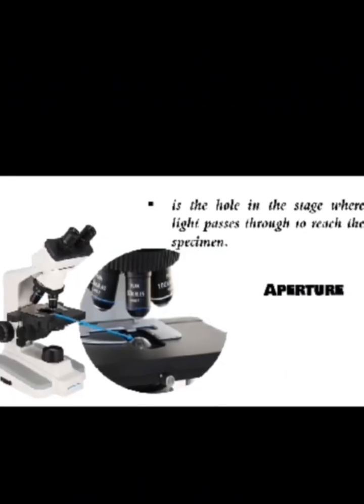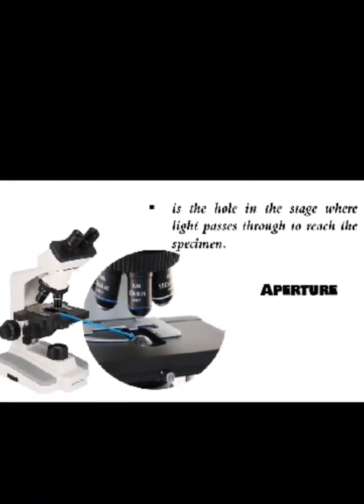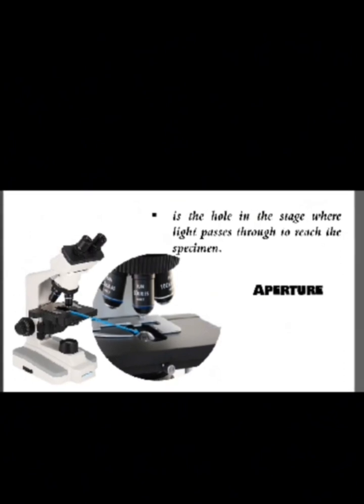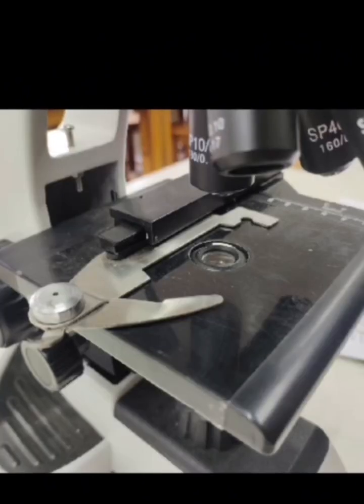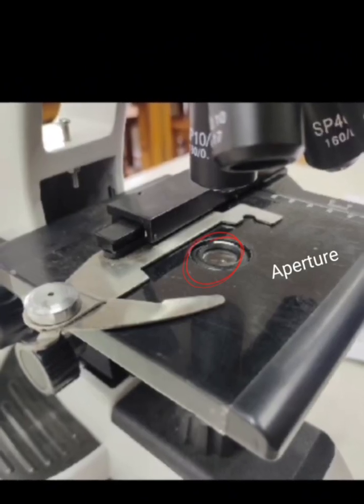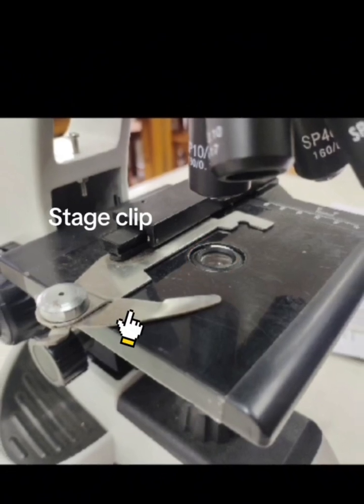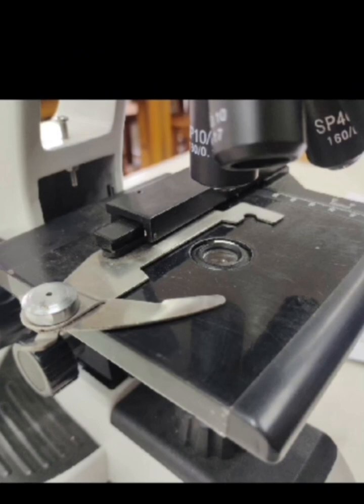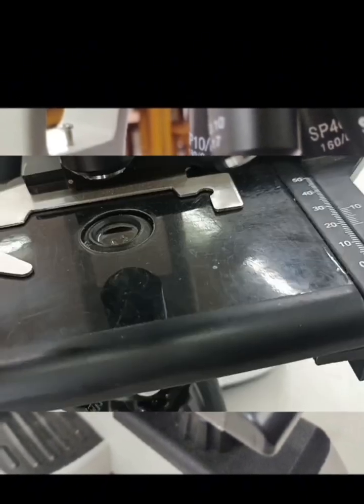On the stage, we could see an aperture. Aperture is the hole in the stage where the light passes through to reach the specimen. Along with the aperture, there is also a stage clip in the stage. The main function of the stage clip is to keep the slides in place.